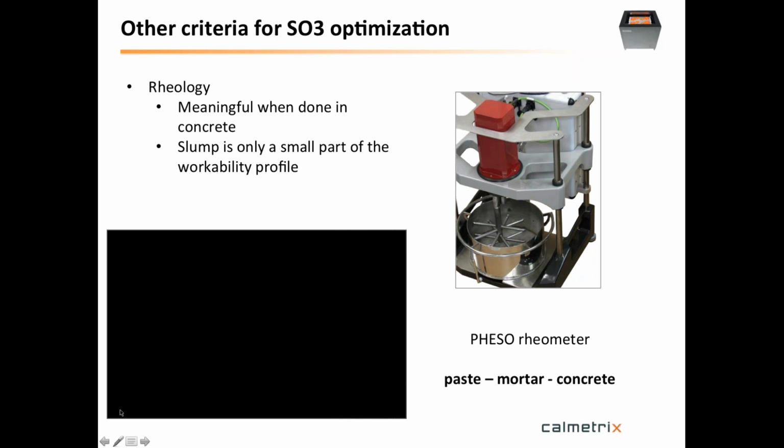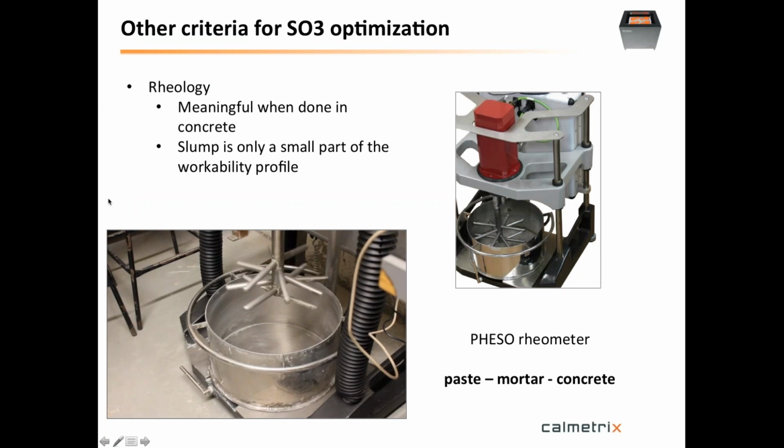Now I can actually play a little video here, I think. I thought I could show how this thing works. Hold on. I hope the video shows okay. But you see there's a planetary motion to keep the things mixed, and you'll see in a minute when the actual concrete is in there.